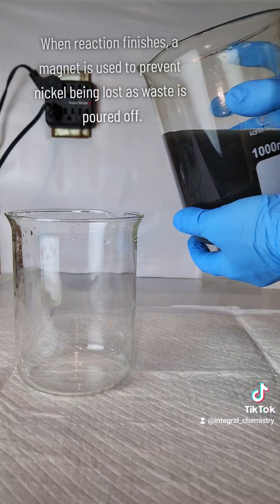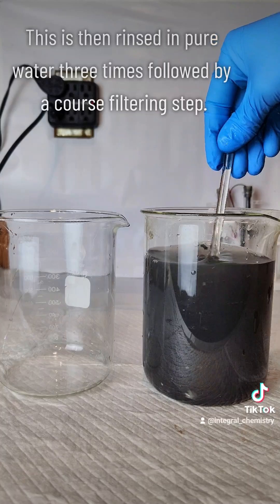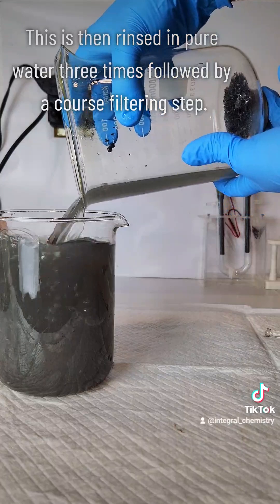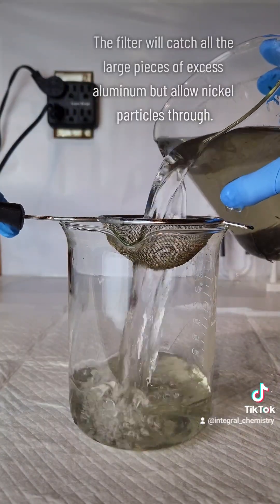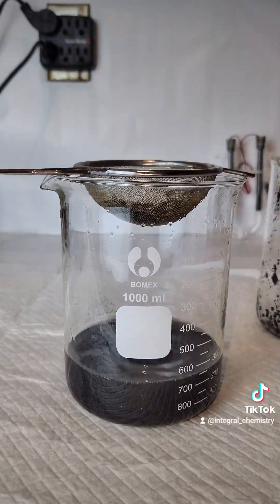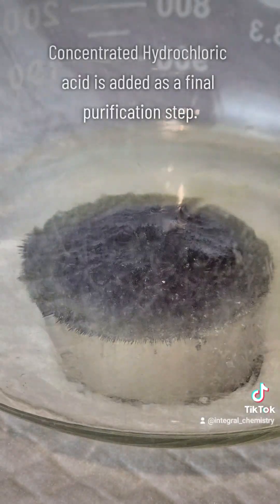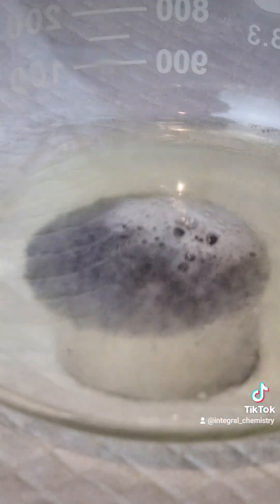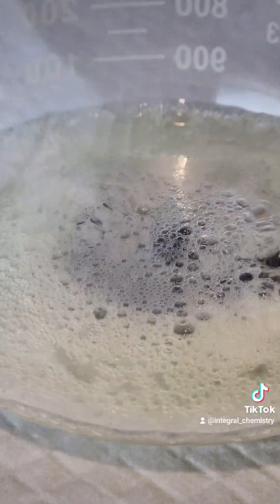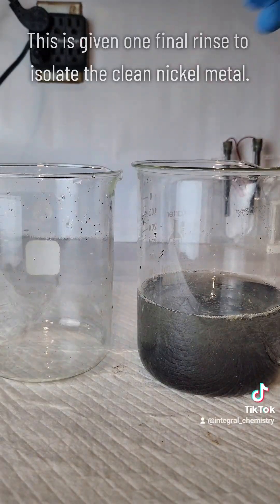This reaction is allowed to go to completion, and to wash my nickel metal I place a magnet at the bottom of the beaker while I do several water washes, which keeps all of my nickel metal in the beaker while washing away all of the impurities. I do three washings followed by a filtration step to get my nickel as clean as possible, and when that's done I put it all into a beaker and add some concentrated hydrochloric acid. Interestingly, nickel metal will only react with dilute hydrochloric acid, so the concentrated acid gets rid of all the aluminum and leaves the nickel behind.